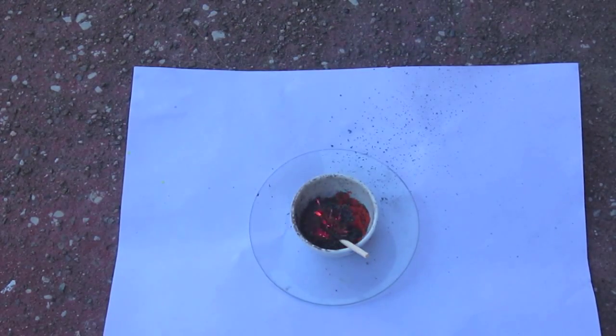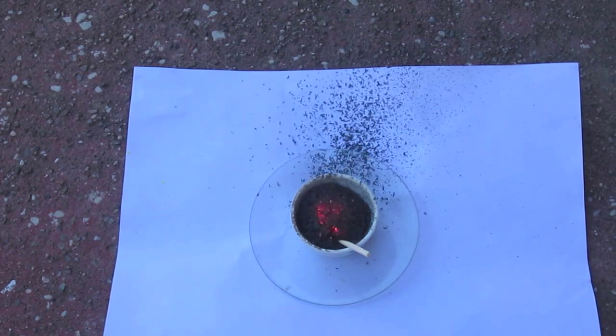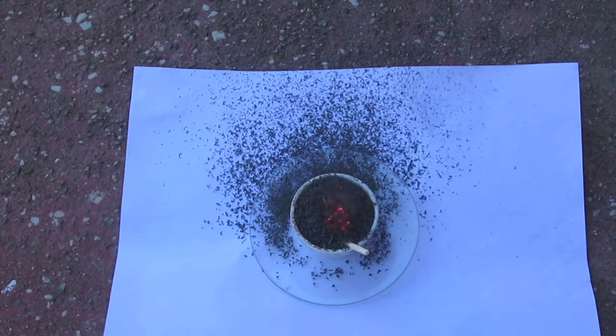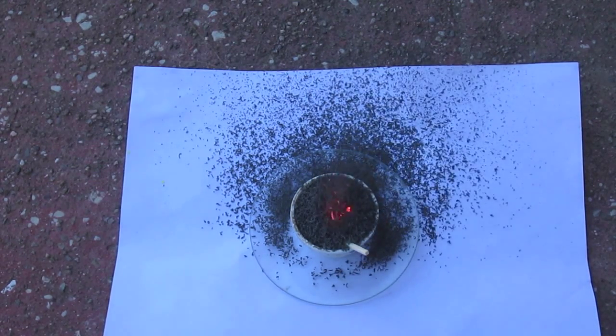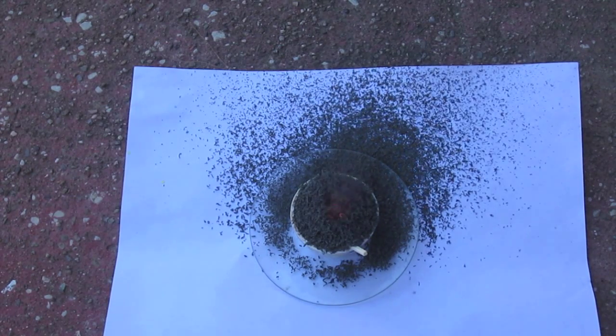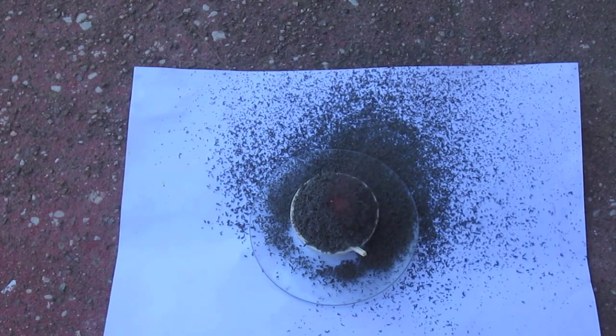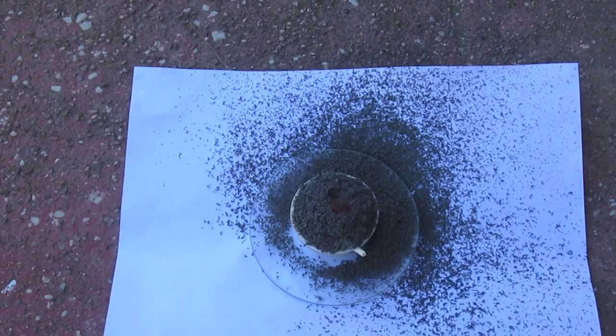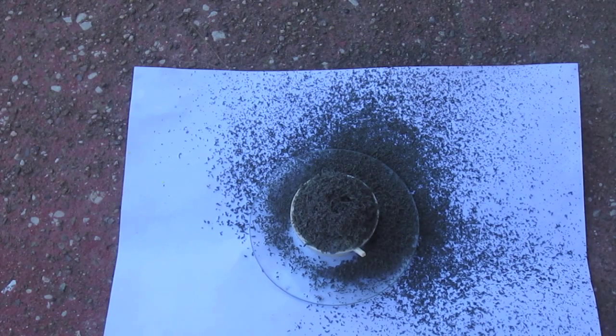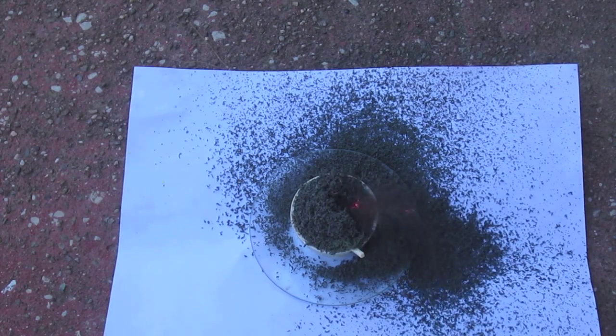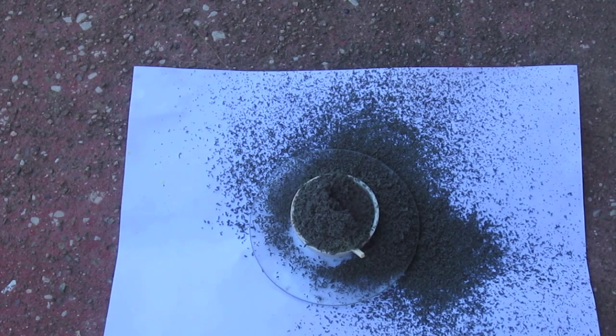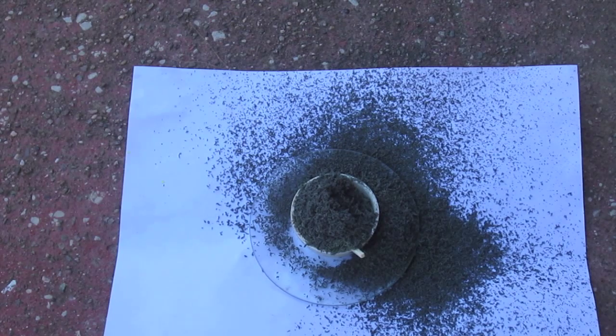The reason I used ammonium dichromate for this volcano experiment, as it's sometimes called, instead of potassium chromate or potassium dichromate, is that ammonium dichromate is exceptionally unstable, more so than other dichromate or chromate salts, because the dichromate anion is oxidizing, and the ammonium ion is reducing. So when you have an oxidizer and reducer all in one salt, then that will make that salt very unstable. So doing this experiment does not work nearly as well with other dichromate or chromate salts.